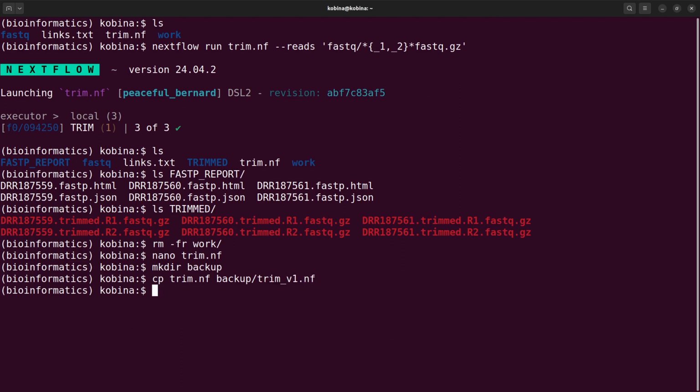This is just a backup. The reason why we are doing the backup is so that in case we make some mistakes, we can revert back to the original one. So it's always important to back up your script or do versioning. If you are going to do a major update to your scripts, you need to make sure you give it a version. What we have now is version 1. That's why I just copy it and name it this way. If you have to make another backup, I'll make it version 2. But for now, we'll just proceed with this name.